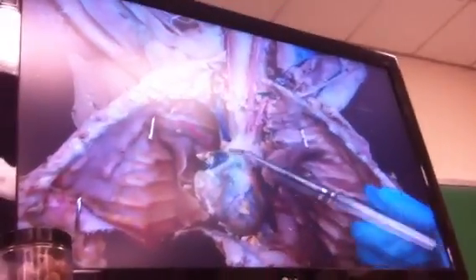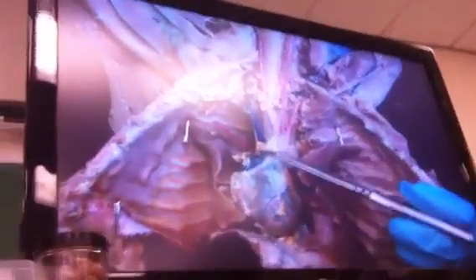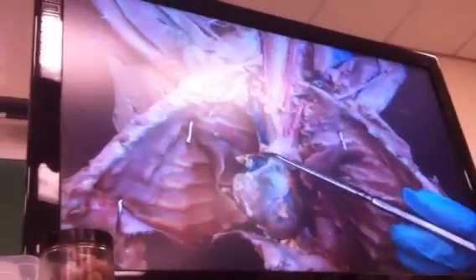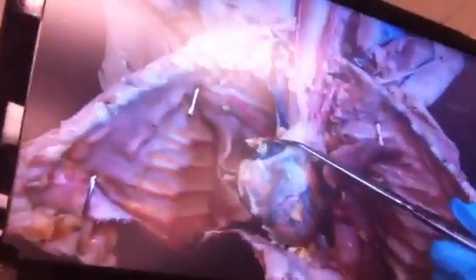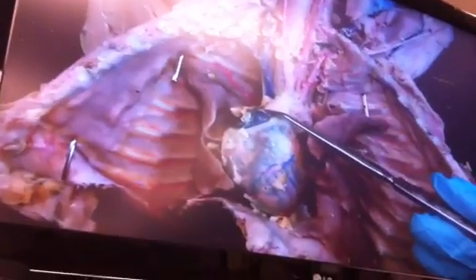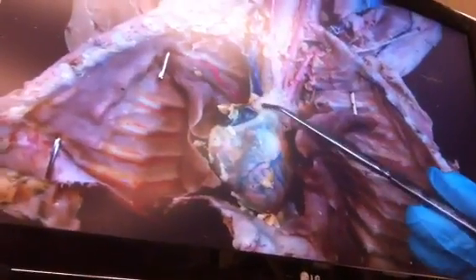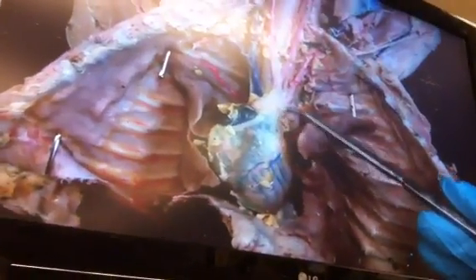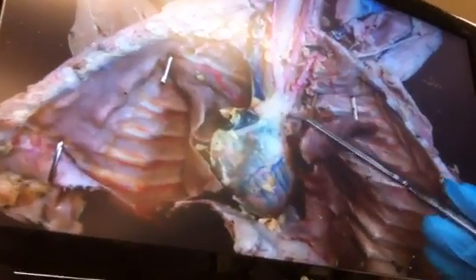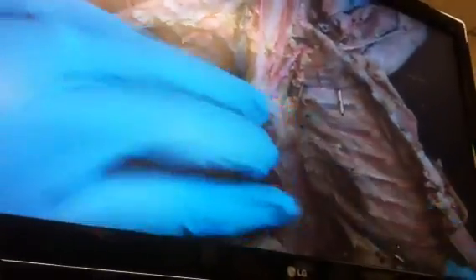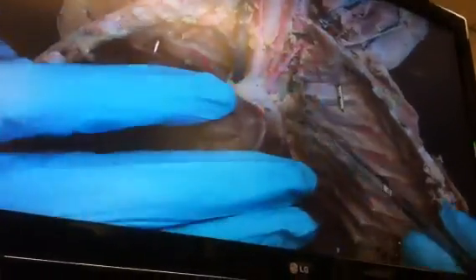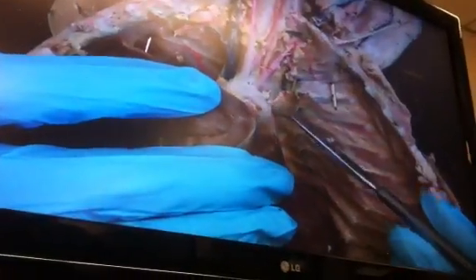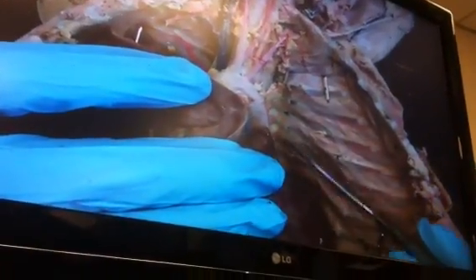If you look right here, you're going to come up — this right here is the ascending aorta. If this is the ascending aorta, this is the aortic arch. If this is the aortic arch, you're going to call this the descending thoracic aorta.